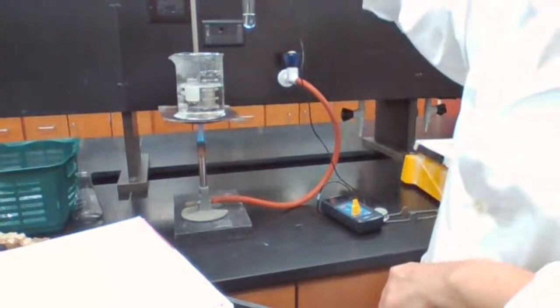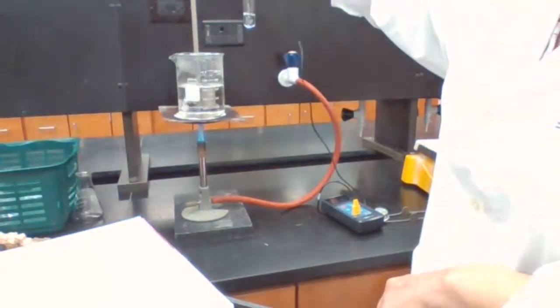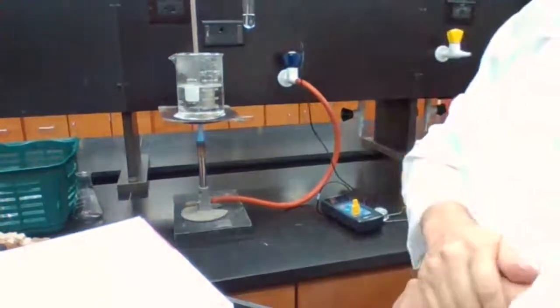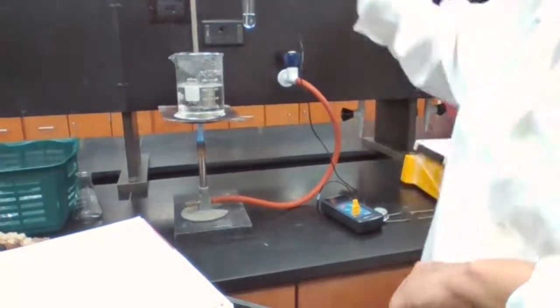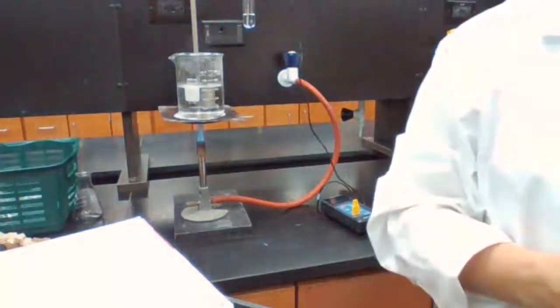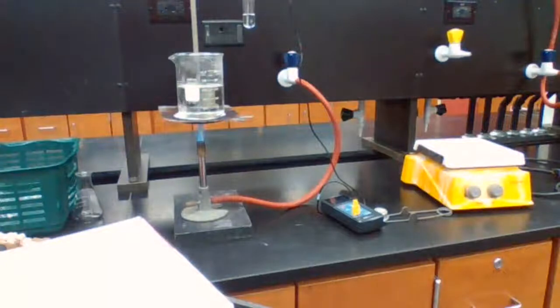While it's cooling down, I need to measure 0.8 gram of the unknown. I'm using unknown A again. So I'm going to measure 0.8 gram of the sample while this is cooling, so I could have my chemicals ready for the next step. Let me see which unknown I'm taking.